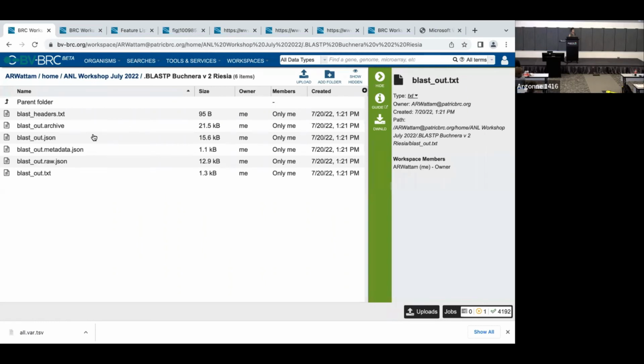The question was, can I get an alignment from BLAST? At this point, I can't imagine that you would want the alignment that I showed you. But if you did, you could submit that same thing to the alignment tool that I think is going to be demonstrated next. And that way you could download that alignment of your dreams.